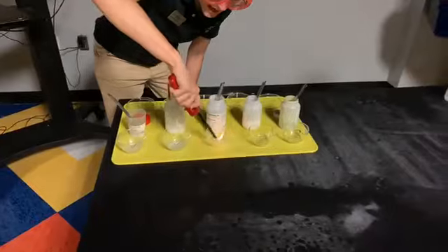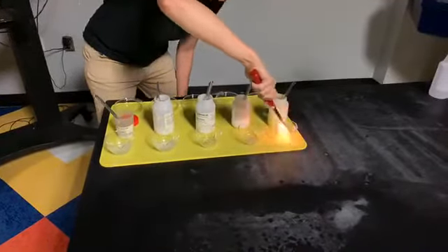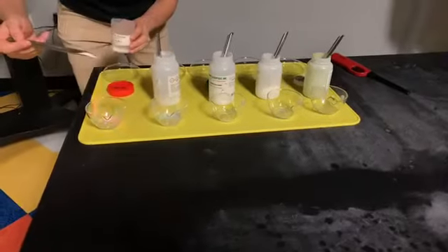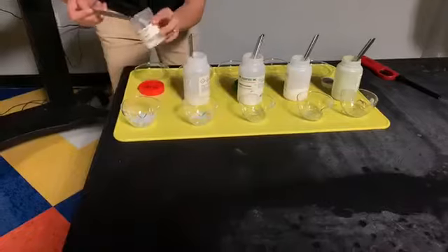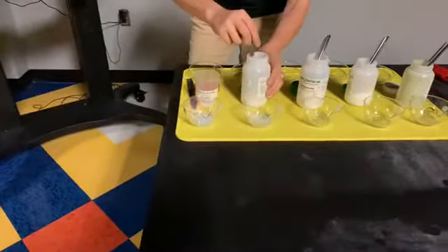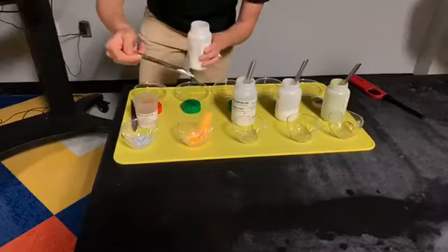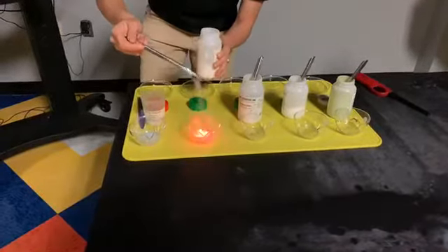And what I'm going to add to each of these fuel sources is a different chemical into each different petri dish. And they're all variations of salt. So this first one that I have here is just regular old table salt. And you can see, as I add it to the flames, they turn this nice orange color. Versus, I have a different salt here. This one is made with strontium chloride instead of sodium chloride. And when I add it to the fire, it burns this nice red orange. It's much more vibrant.